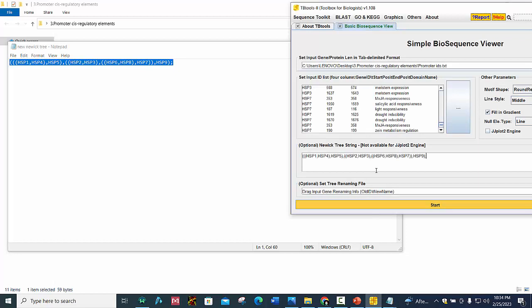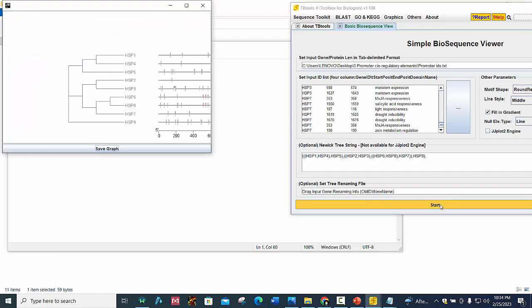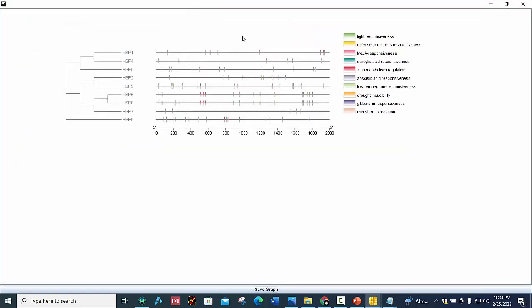And then press start. So here you can see it gives us the location of cis-regulatory elements in promoter region.